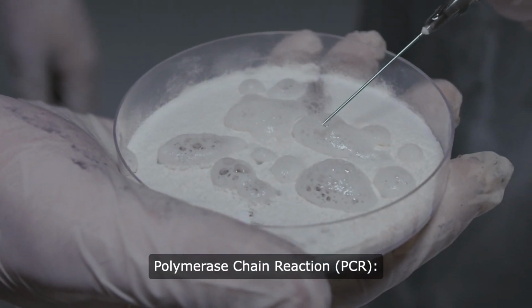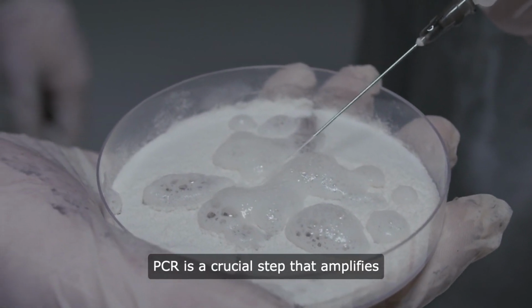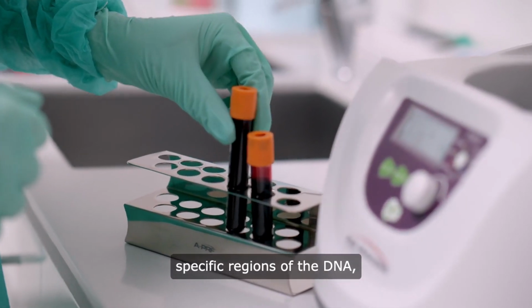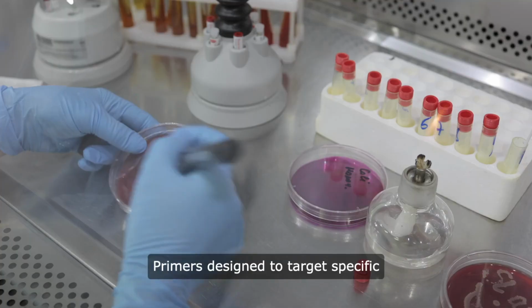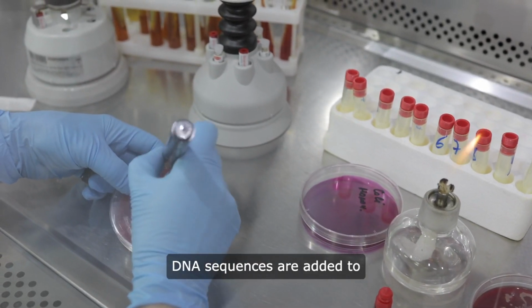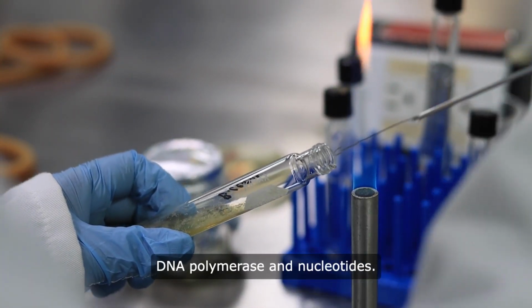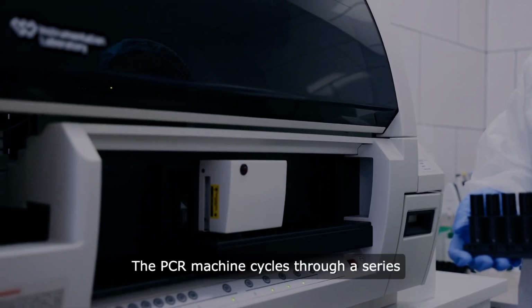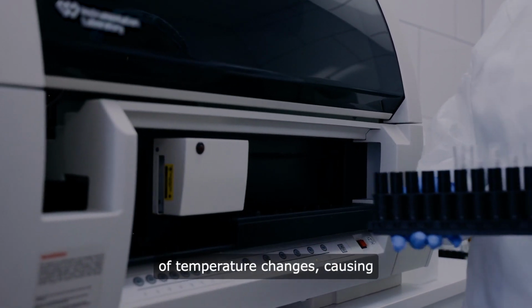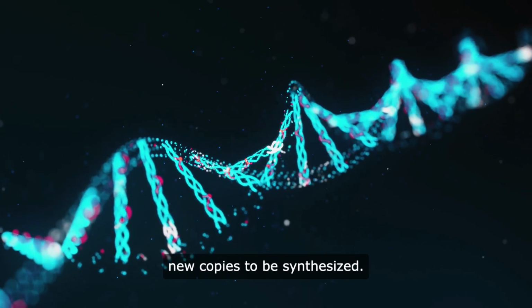Polymerase chain reaction, PCR. PCR is a crucial step that amplifies specific regions of the DNA, making them easier to analyze. Primers designed to target specific DNA sequences are added to the extracted DNA along with DNA polymerase and nucleotides. The PCR machine cycles through a series of temperature changes, causing DNA strands to separate and new copies to be synthesized.